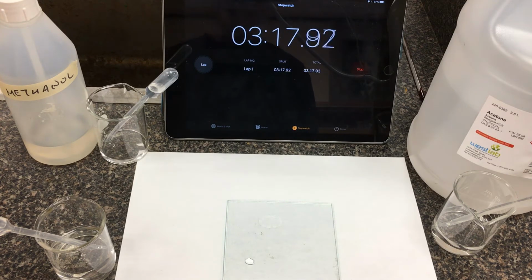Again, it's slightly not fair for comparison because the droplet sizes were a little bit different. The water drop I can pretty much keep to a single drop. Methanol and acetone were maybe 2 or 3 drops altogether. But even qualitatively, you can make this comparison here. So we just have a last little rim of methanol here just evaporating away. We're about 3 minutes now.